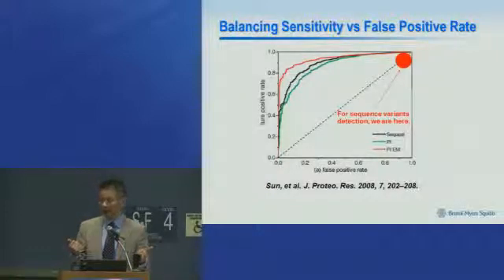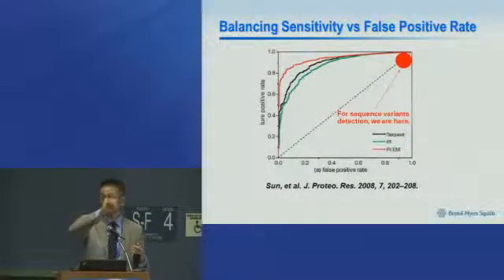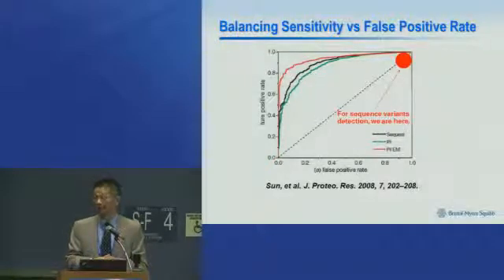We use mass spec and search all possible cases where any amino acid can be replaced by another one by point mutation. We search against it, and then you have a large number of so-called false positives. And in order to rule out that those are not from the heterogeneous cell line takes a long time. So that's where the technical bottleneck is.